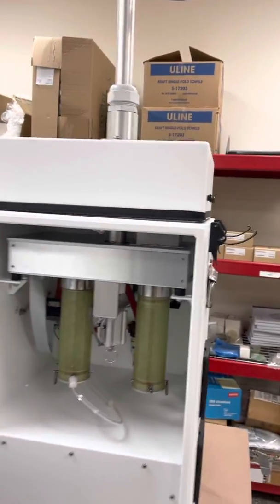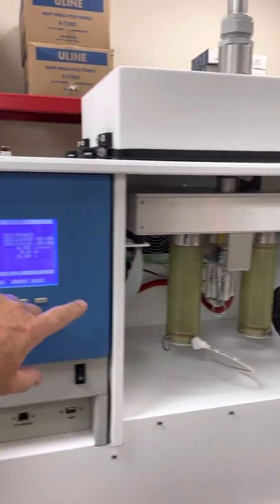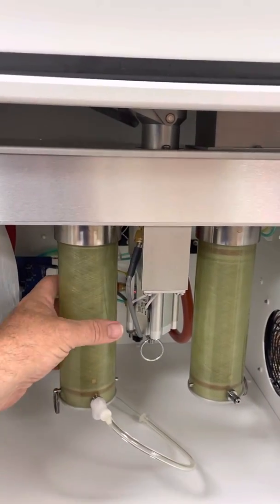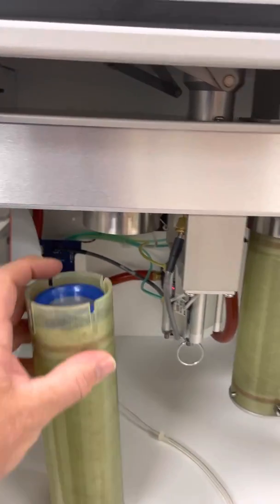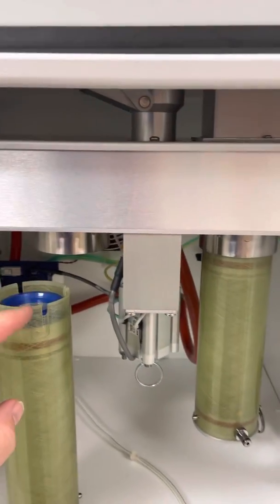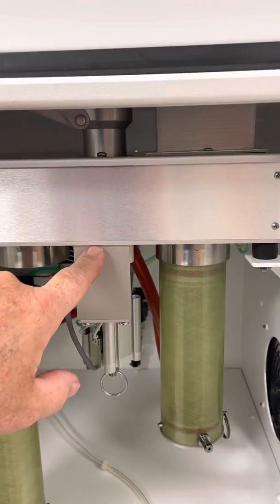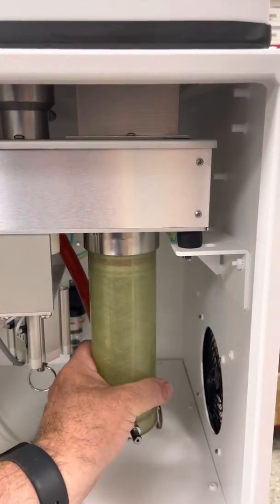Opening the front door, we have the electronics cabinet on the left with the screen, and on the right we have where the sample cassettes are located. On the left, you have a cylinder where your pre-loaded, pre-weighed sample filter cassettes will sit — you can have up to 16 stacked in here. After the unit has run each cassette, the cassette will go up, move over into the sample collection position, take the sample for 24 hours, and displace the cassette into the collector cartridge.